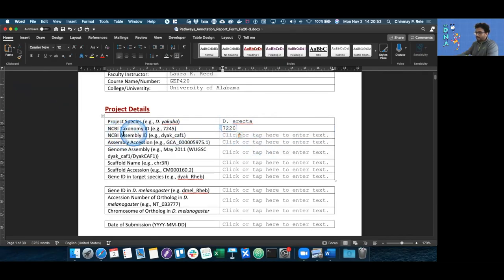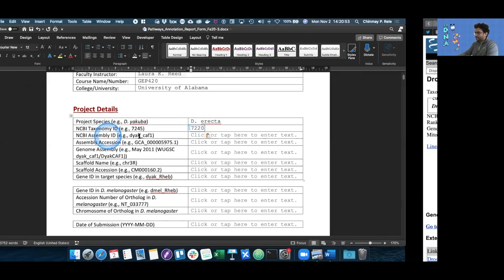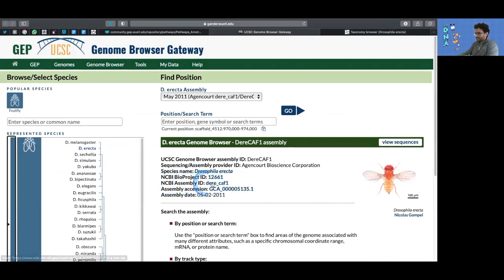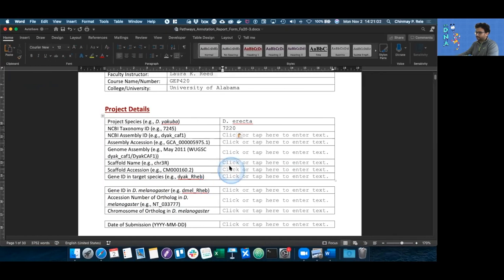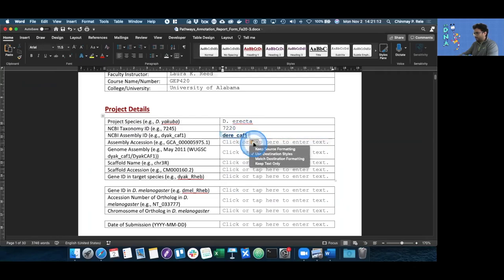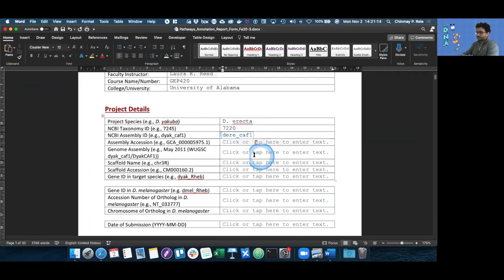Now I need the NCBI assembly ID. We go back to the genome browser, and the NCBI assembly ID is right there, dr_CAF1. So I just copy it, go back to my report form, paste it, and then keep text only as always.